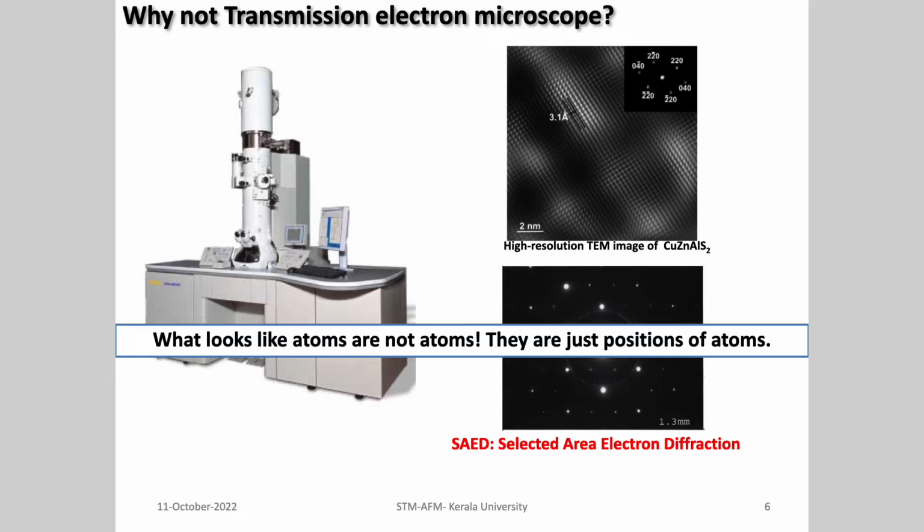Okay. And most of the images you are seeing like this are a little bit fake images, because you can see there is a lot of spreading here, right? This is a larger one, this is a smaller one. I can actually select a small area using software. I can avoid all types of noise from here. I'll get a beautiful image like this. Okay. Normally people won't do that. It takes some time to filter it and do a modification of it.